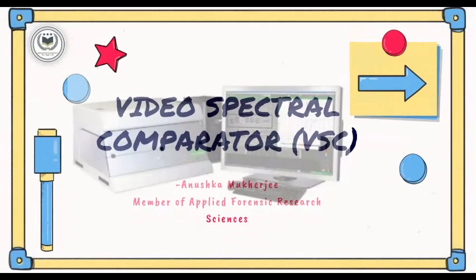Today we are going to discuss an instrument known as the Video Spectral Comparator, VSC. This video will be presented by me, Anushka Mukherjee, member of Applied Forensic Research Sciences. So let's start with the discussion.